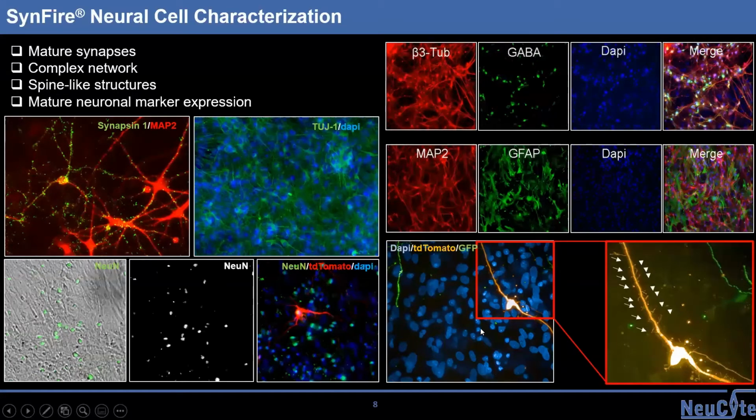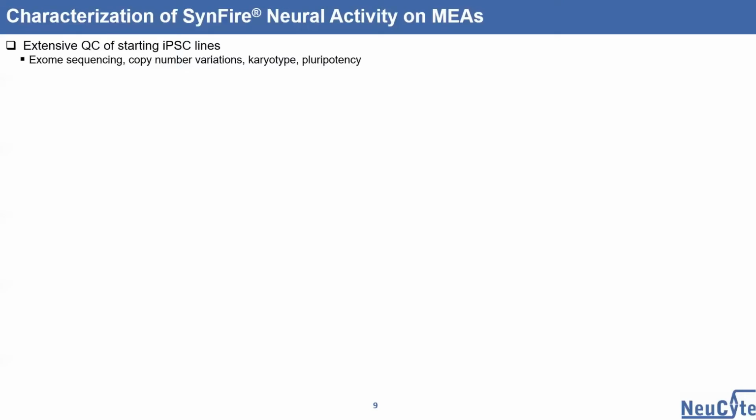And especially important for high content analysis is that in a more mature stage of those co-cultures, we can also analyze fine structures like spines. So in this case, this is one single genetically labeled neuron on a dense bed of unlabeled neurons, so that you have all the environment in there that it needs to turn its filopodia into spines and so on. So all the markers are expressed, and the morphology is neuronal. And with this approach, we already have a good angle on making a stable product or a stable cell type for assay application.